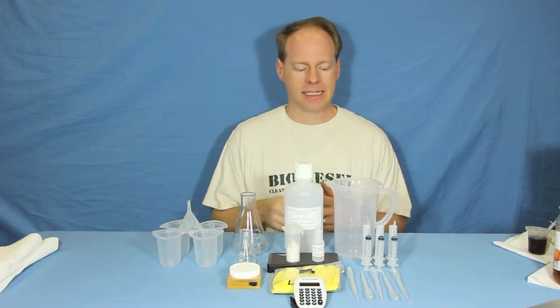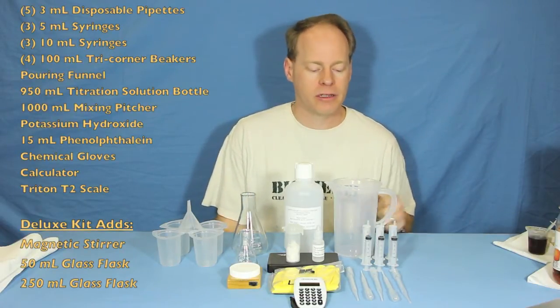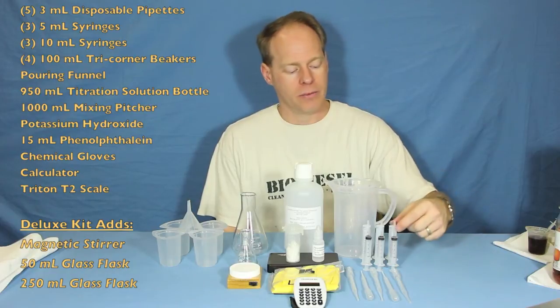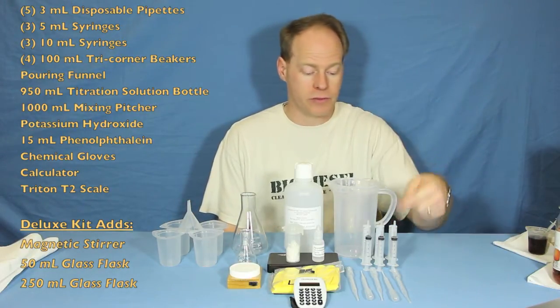Let's talk about what's included in this kit. We've got five of our three milliliter disposable pipettes, three of our five milliliter syringes, and three of our really fancy syringes without the rubber tops on them. This is what you want to use for the oil.